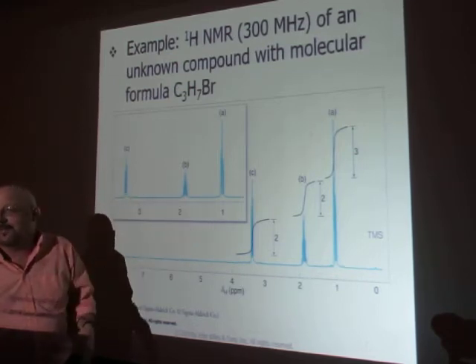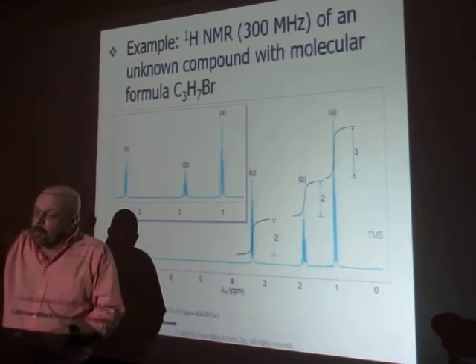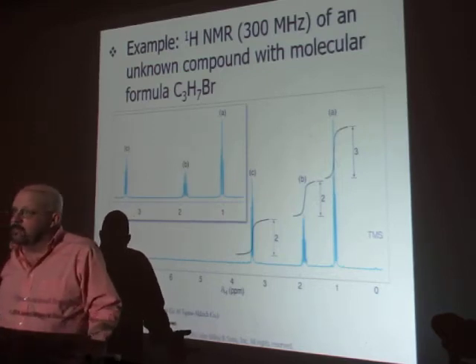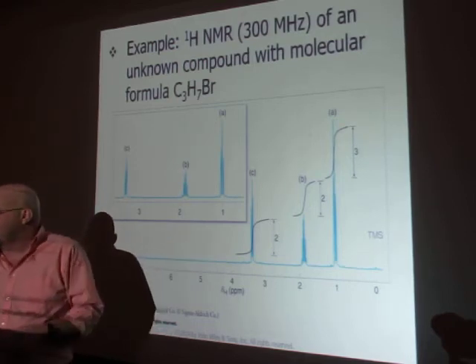There's only one other option for this. It would be 2 bromo propane. 2 bromo propane would have symmetry down the center, and so you'd only have 2 signals. This one's got 3 signals. So that one was very simple.